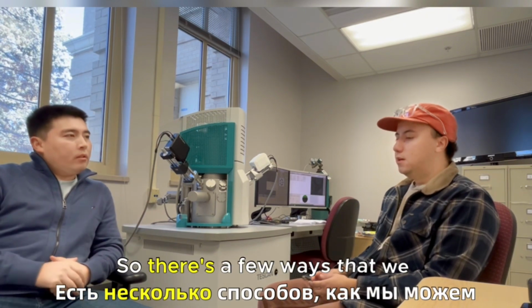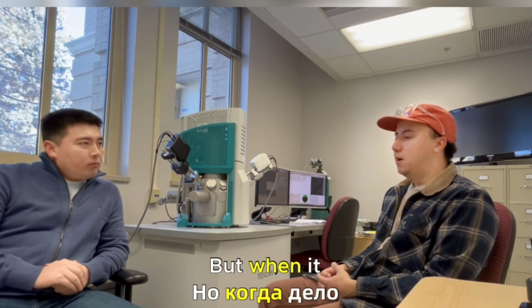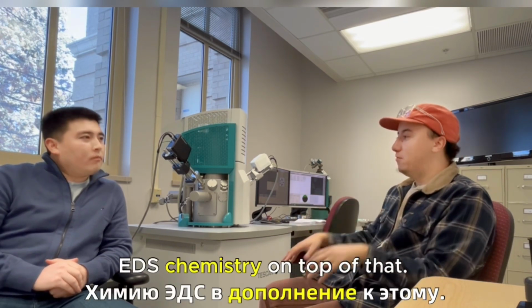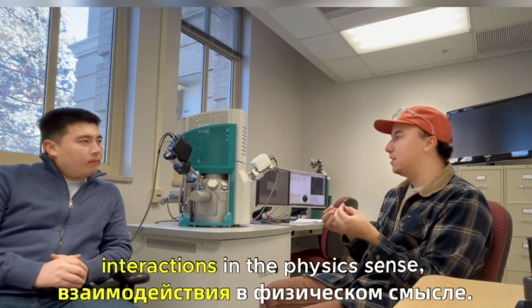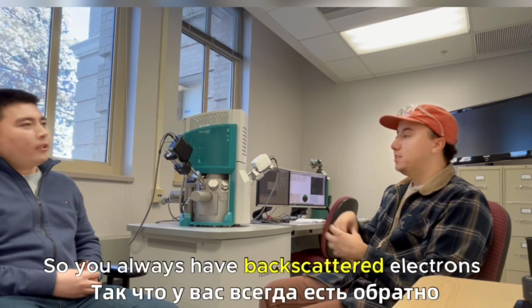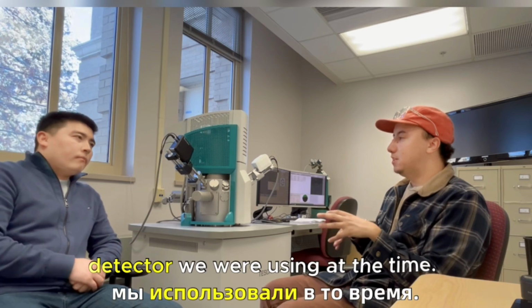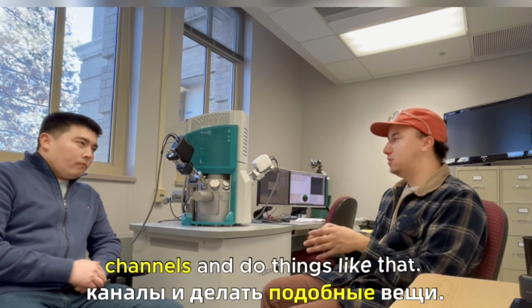Yeah. So there are a few ways that we can use backscatter intensity to do mapping, but when it comes to chemical mapping, that's purely based off EDS. We can take a secondary electron image and overlay EDS chemistry on top of that. Those physical interactions are always occurring. You always have backscattered electrons, and you always have X-rays being scattered. That's how electron beams interact with matter, so it doesn't matter what detector we're using at the time. If we want to add EDS, we just have to have an EDS detector. If we want to overlay BSE, we can mix those channels.